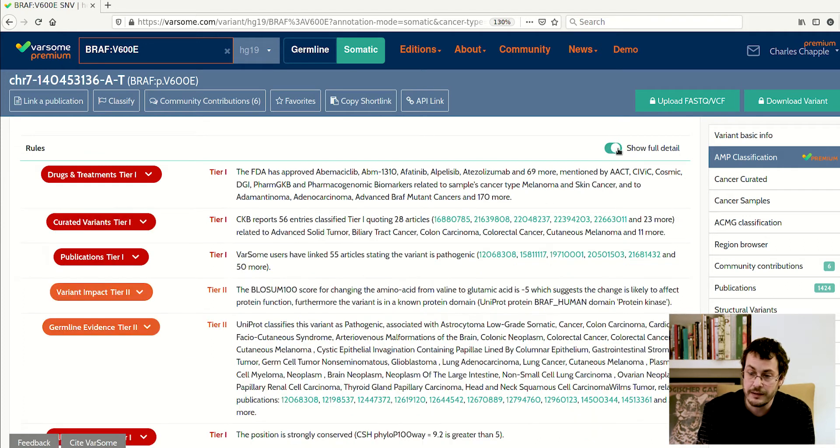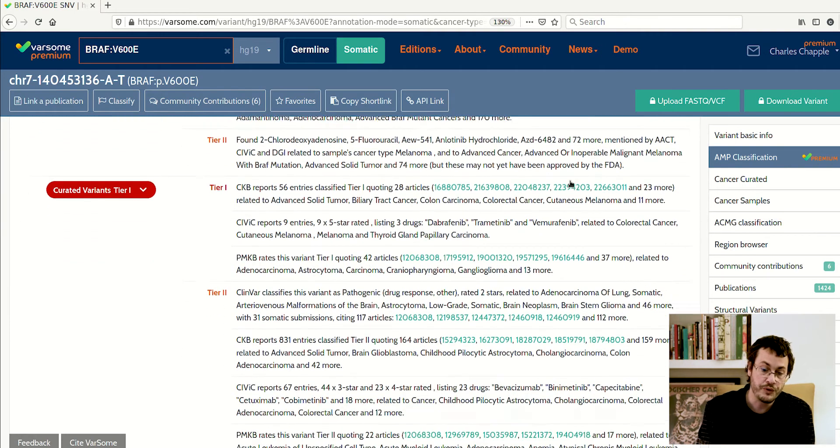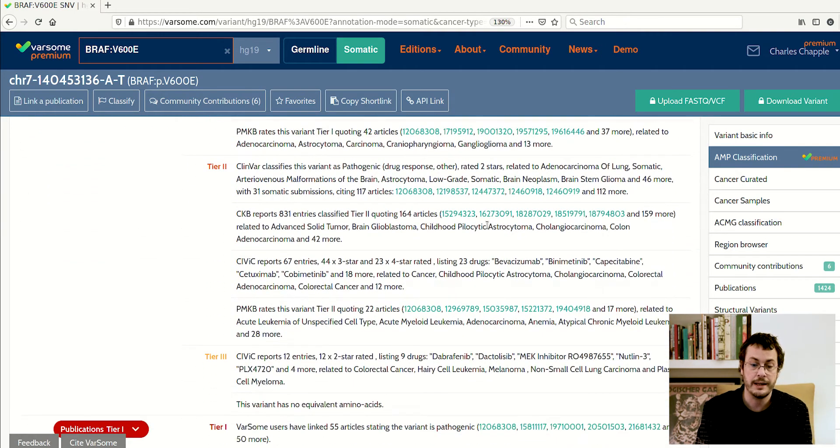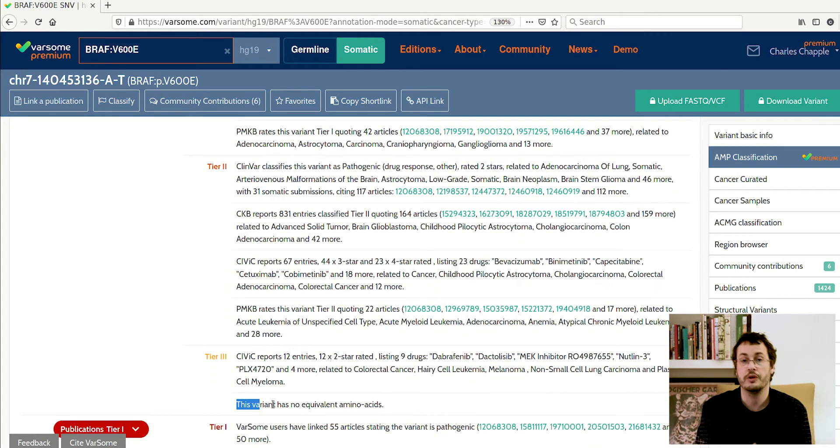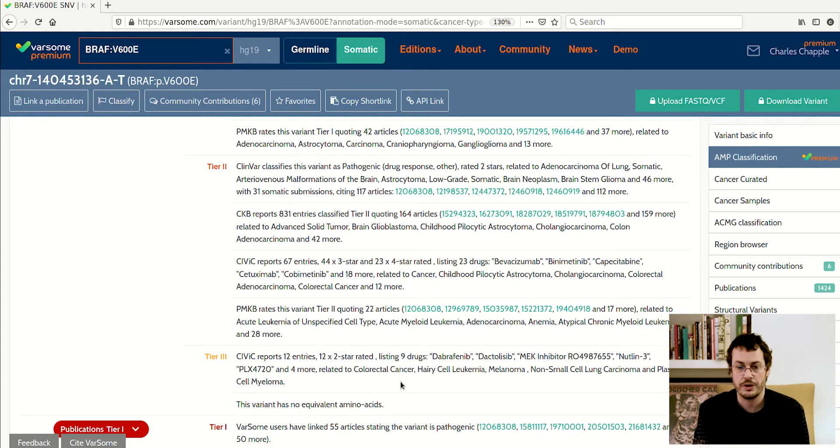If you have selected this option here, the show full detail, you also see the rules that were not applied and why they were not applied, so you can also understand why we made negative choices.